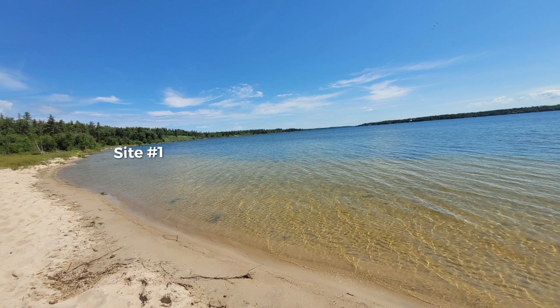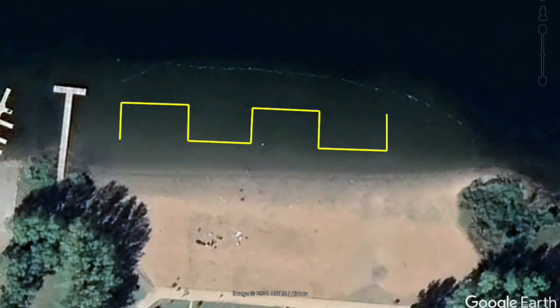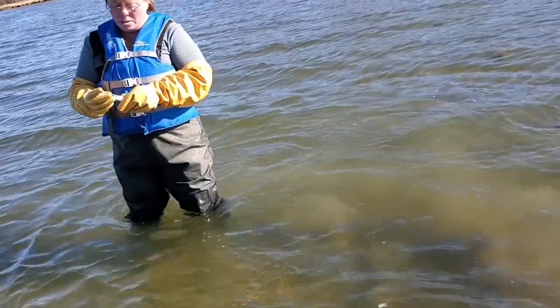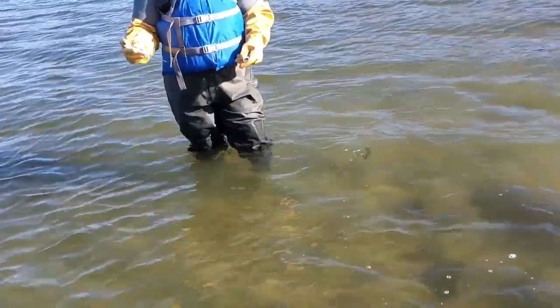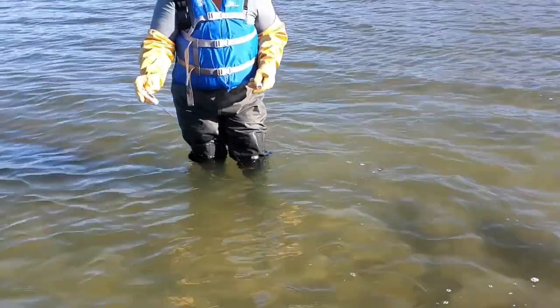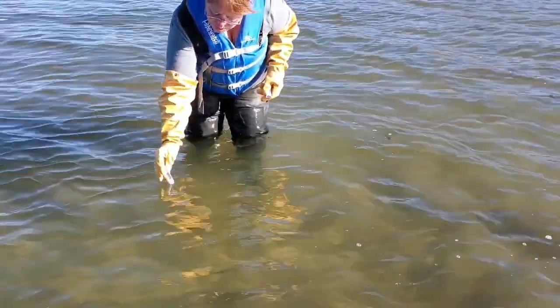This photo shows an example of 5 sites, keeping in mind that you would sample 2 different depths at each of the 5 sites. This photo shows an example of an easy sampling pattern to follow. Before exiting the water, record the temperature at knee to mid-thigh depth. Place the temperature probe in the water and wait until the numbers stabilize.